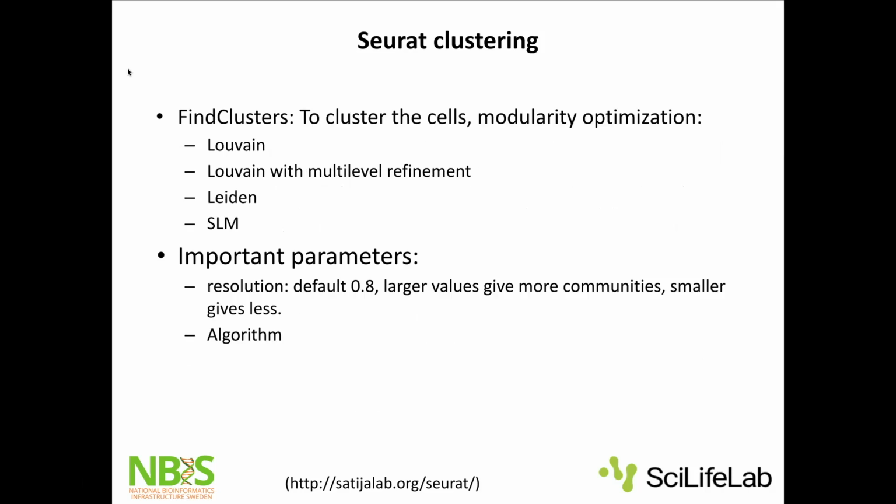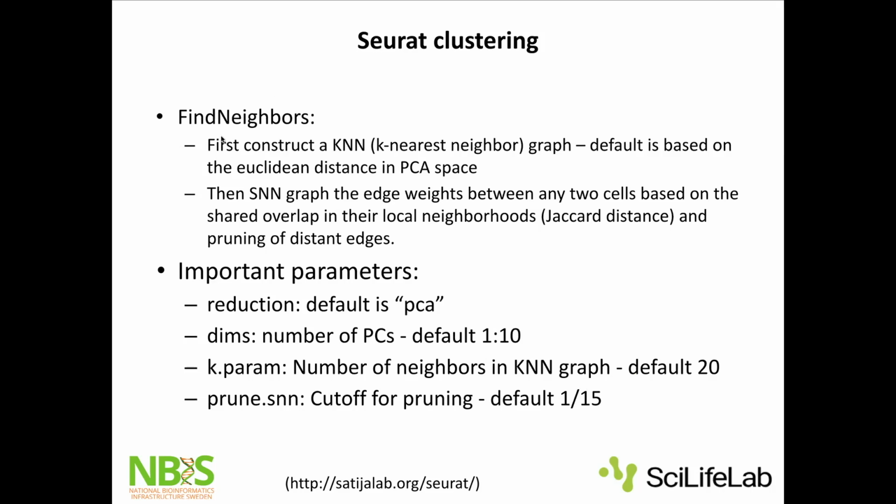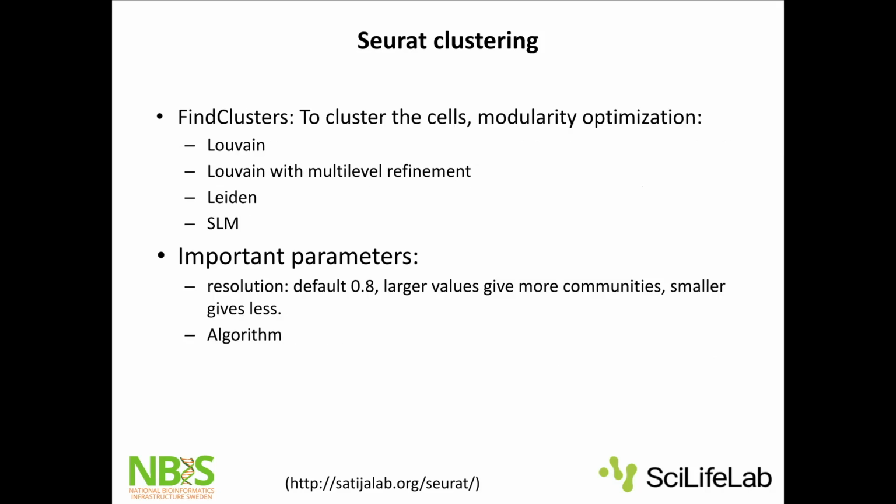After creating this SNN, the second step is the FindClusters function. And these are the different optimization algorithms that are implemented. It's mainly the resolution we can tweak the number of clusters with, and the algorithm. But if whatever you're getting here is not looking good, you sort of need to go back to the graph and reconstruct it with a bigger or lower K, or even a different number of principal components and so on. That's also a way to tweak what you end up with in the clustering.